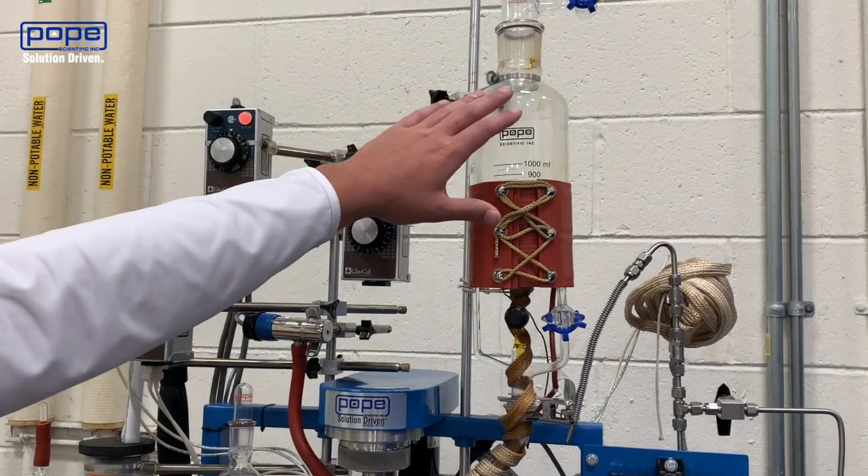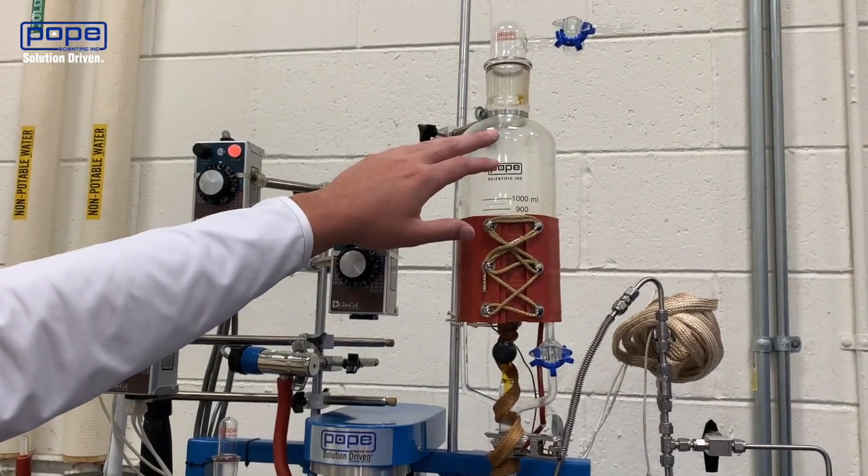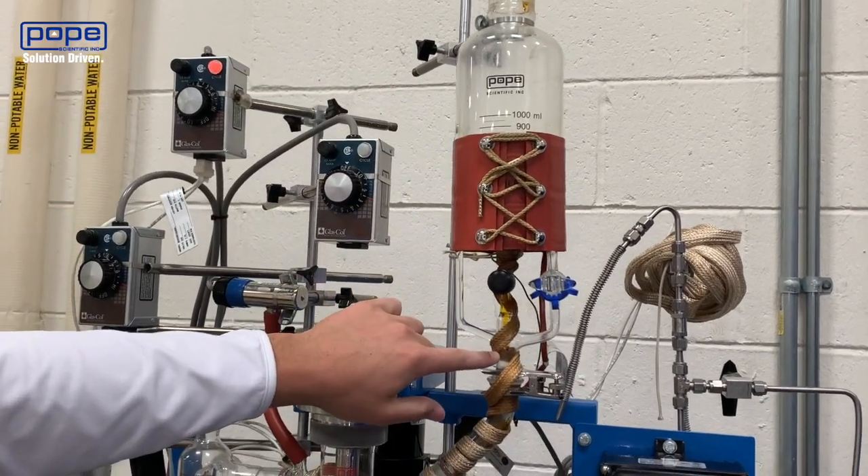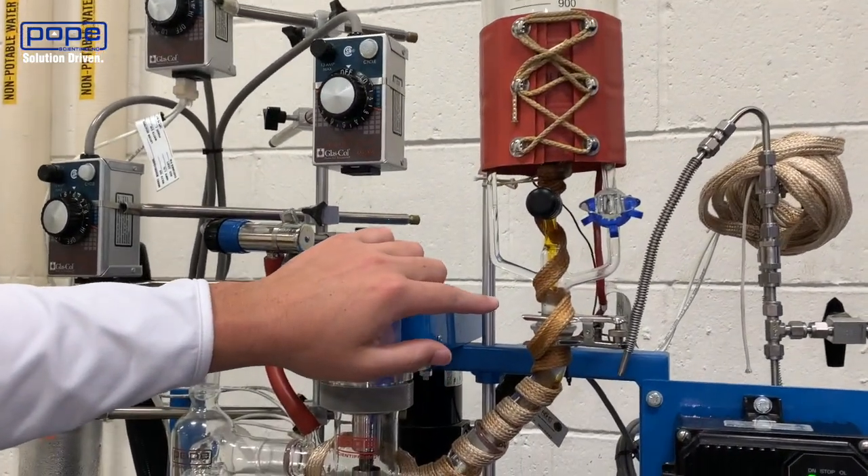To start off, I filled my feed flask with the CBD crude oil that I'll be running today. As you can see, I'm feeding in the crude oil at around a rate of 600 grams per hour.